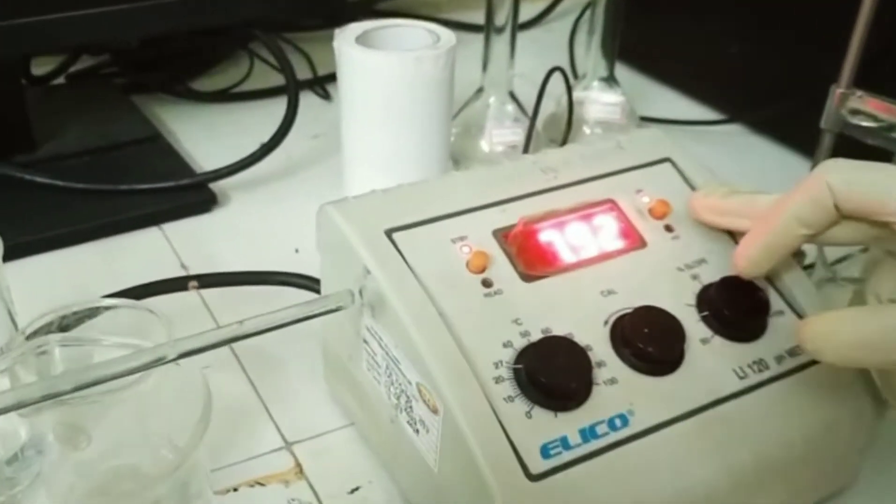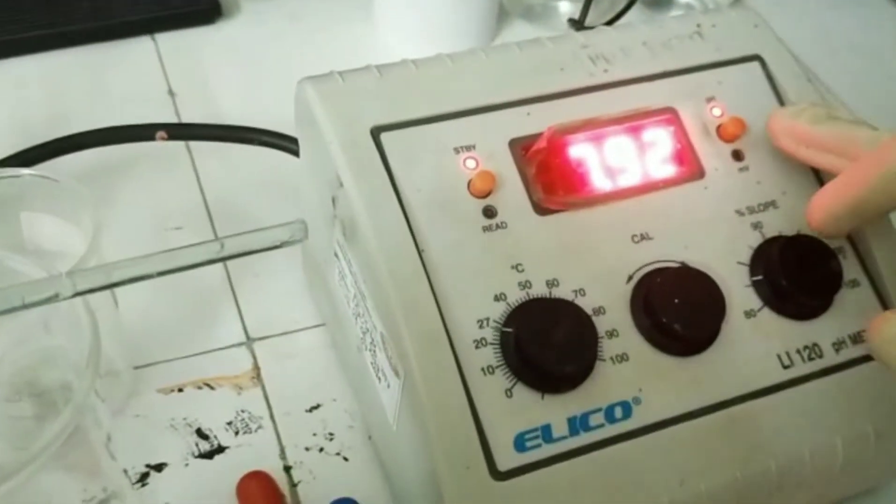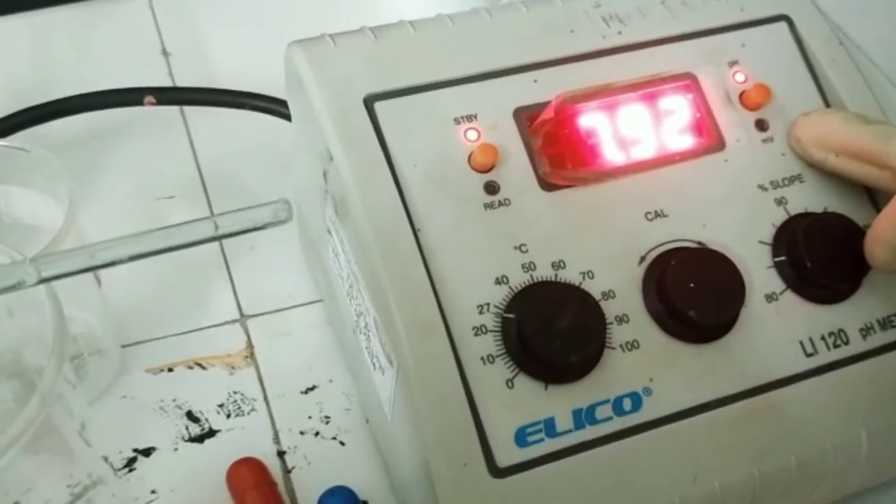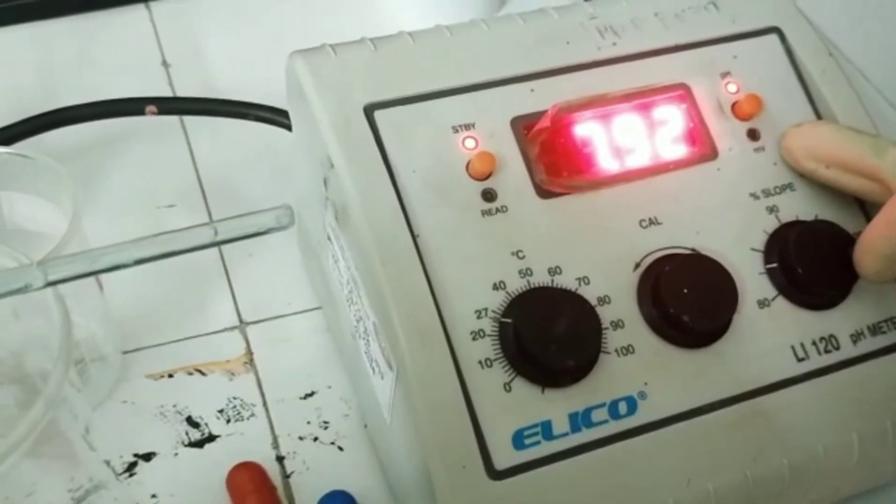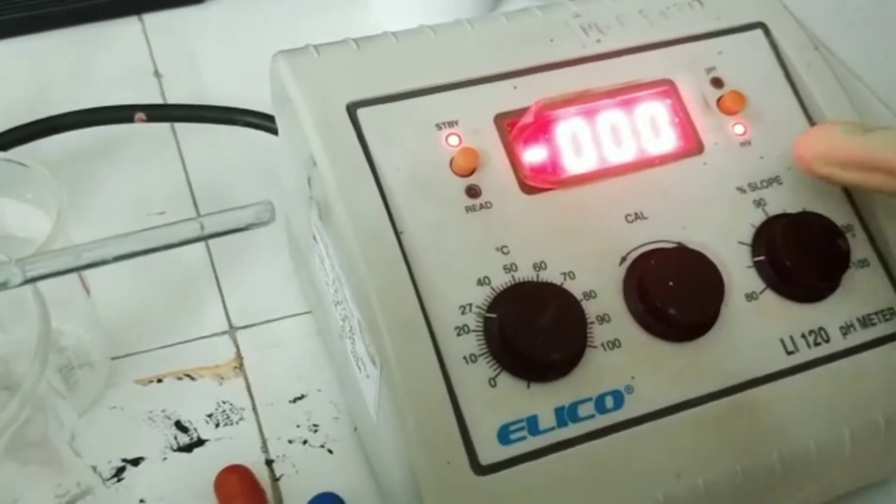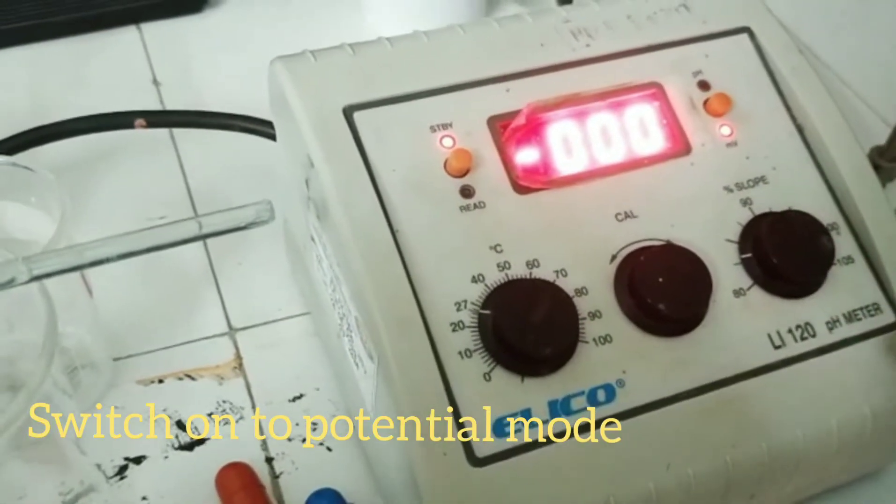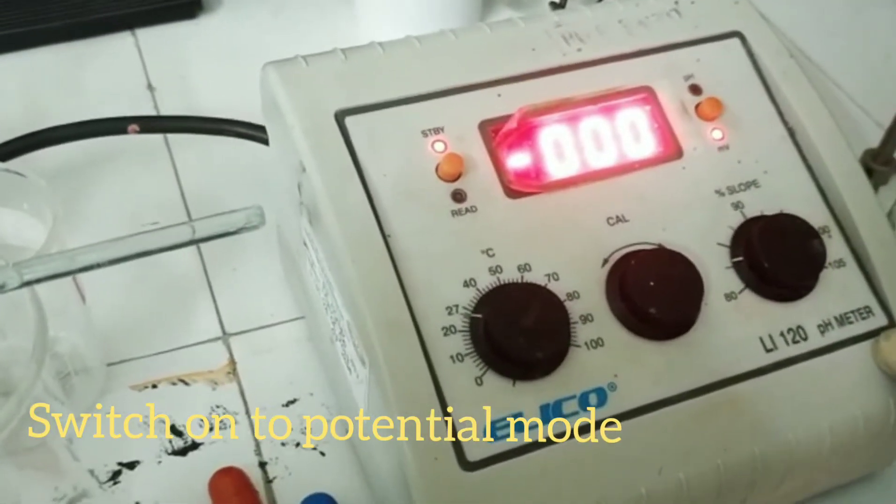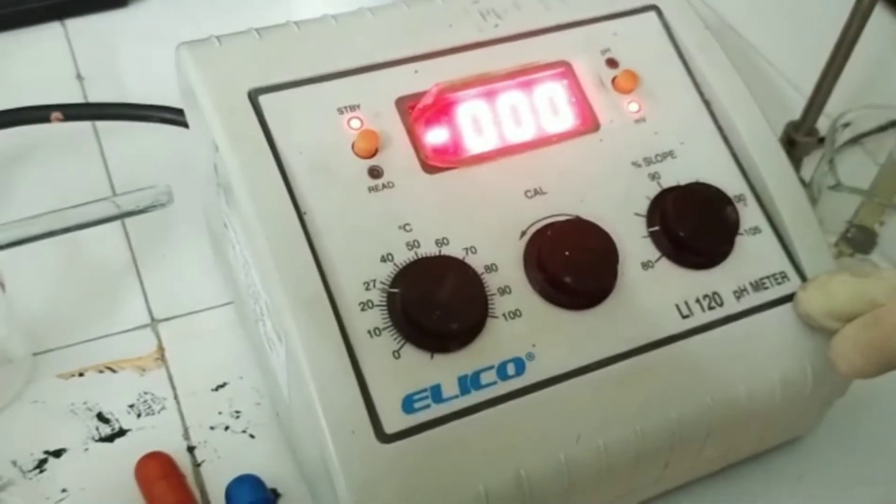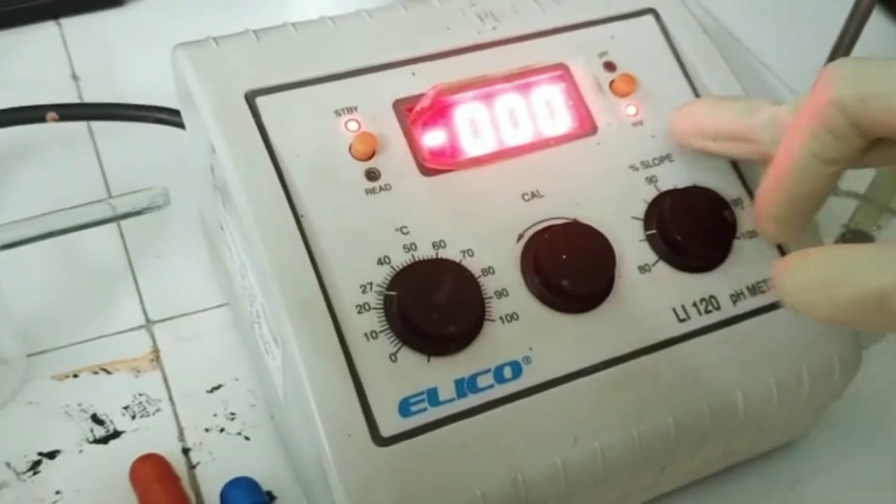In this instrument, we can see two options here. One is the pH mode and the other is the millivolts mode, that is a potential mode. So, today I have switched on to the potential mode because I want to perform a potentiometric titration. Hence, using this instrument, we can even perform potentiometry also simply by moving on to the potential mode.